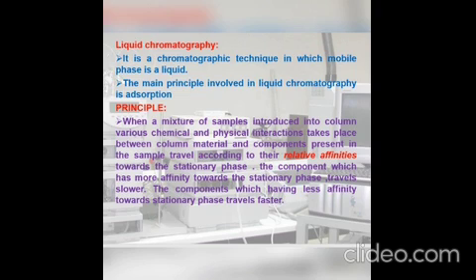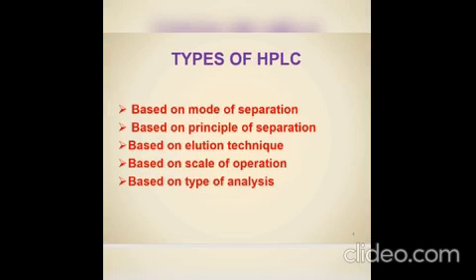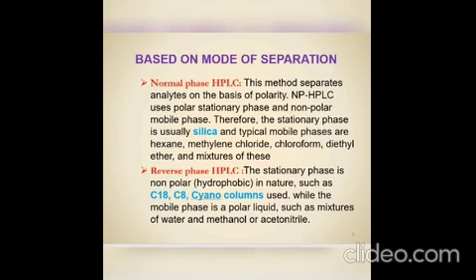Next, types of HPLC. Based on mode of separation, principle of separation, elution technique, scale up operation, and type of analysis, there are 5 types of HPLC. The first one is based on mode of separation. There are 2 modes of separation. The first one is normal phase HPLC and the next one is reverse phase HPLC.